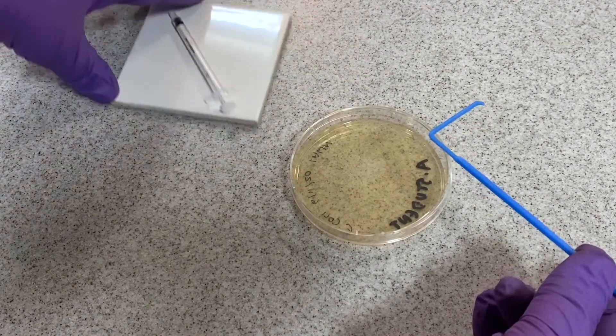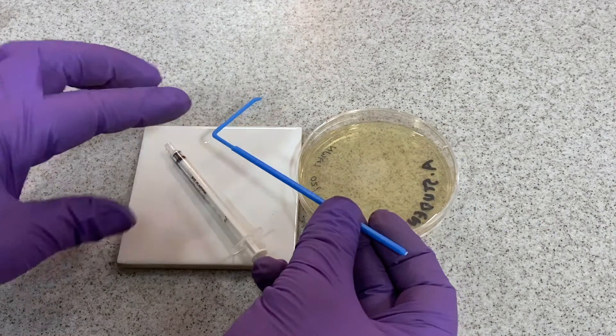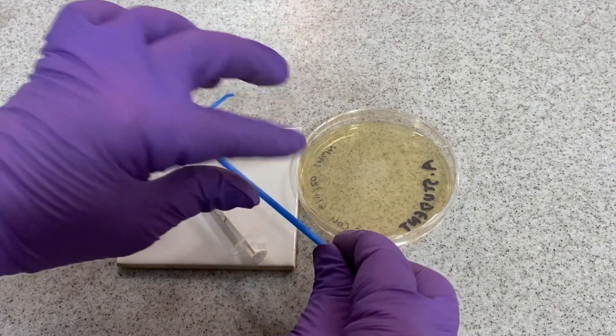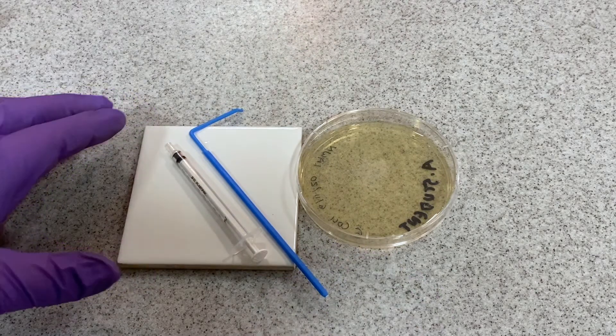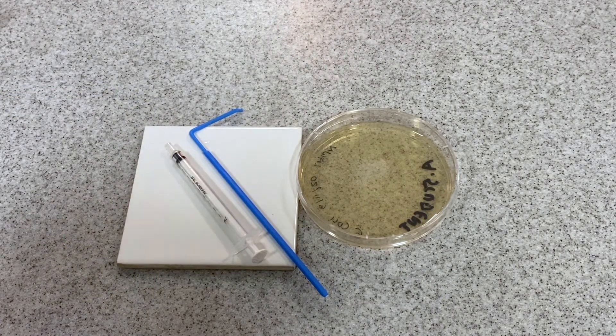The spreader and the 1ml syringe that have been in contact with the bacterial sample should be placed on the white tile provided rather than the surface of the bench to prevent cross-contamination.